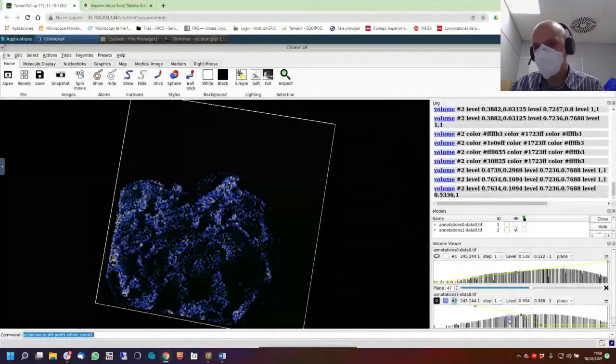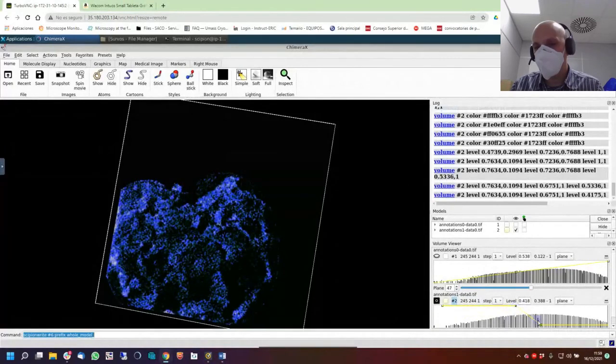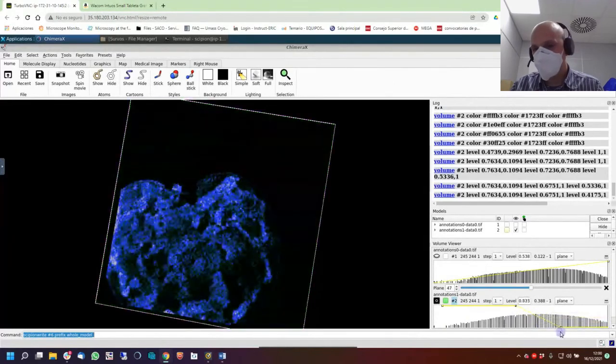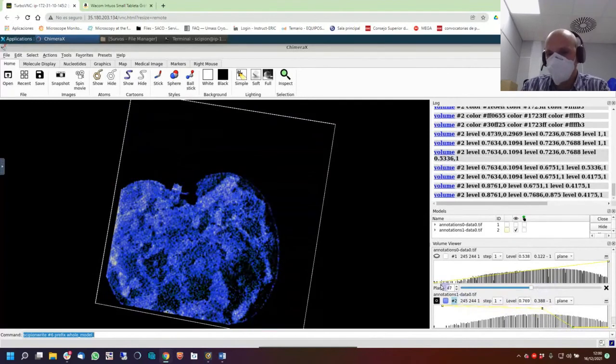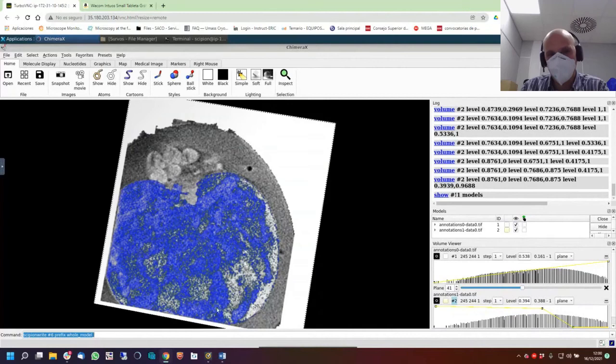It's just a matter of playing with it. Define where are the densities that you need to show. Up means increase the intensity of these values. Going down means that it will not be shown. You figure out how it works? But these are surfaces. And here you see the tensors, both. You see now what's in red, what's not. It's not the same plane, as you can see.